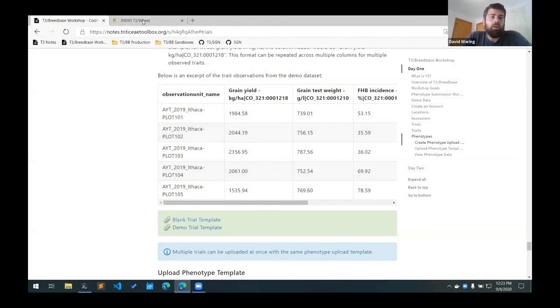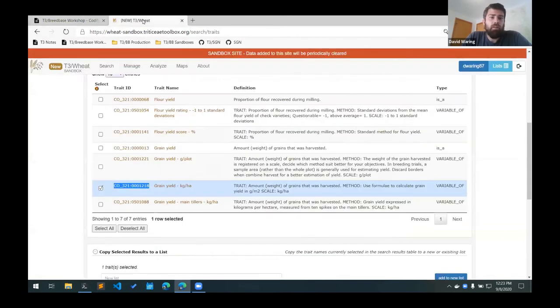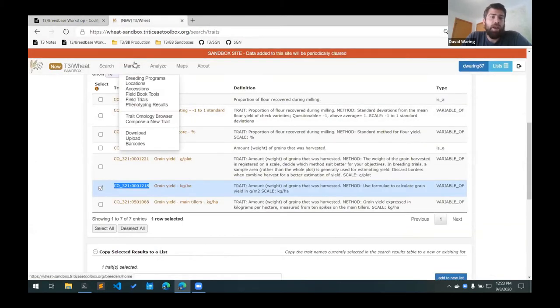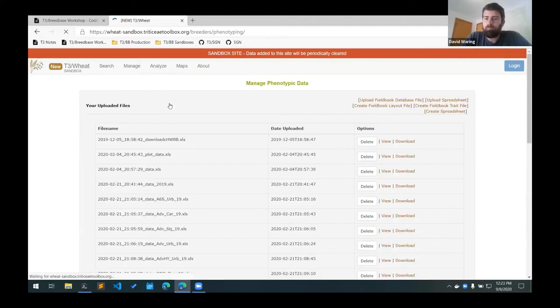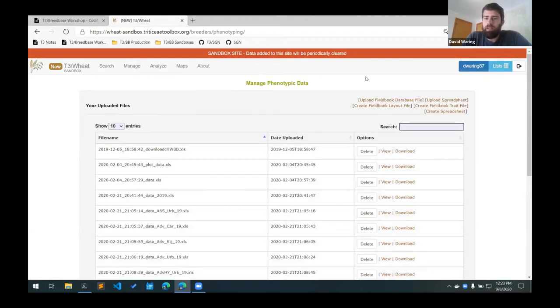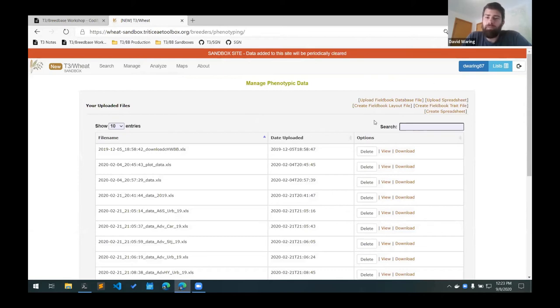So to add our upload template for phenotype observations we go to manage the phenotyping results page. And here there are multiple ways of adding observation data.